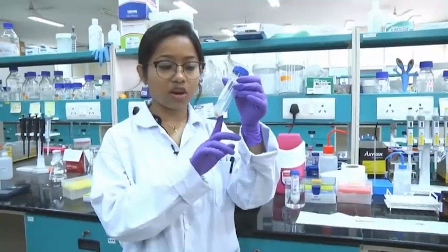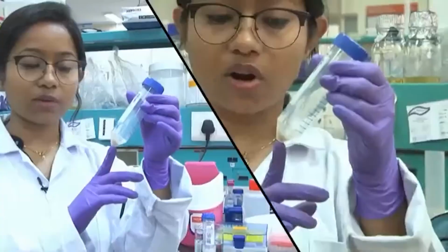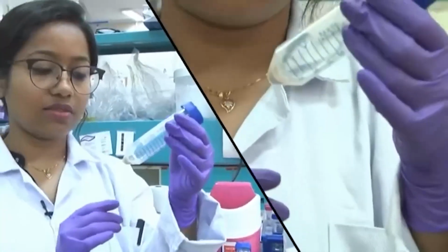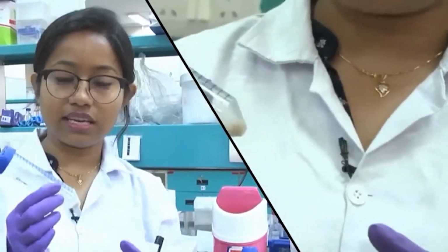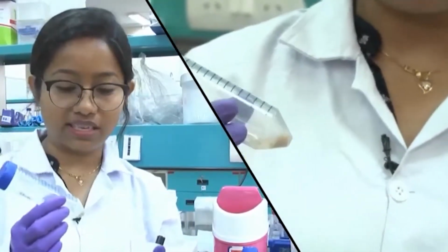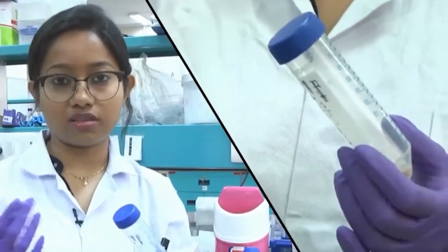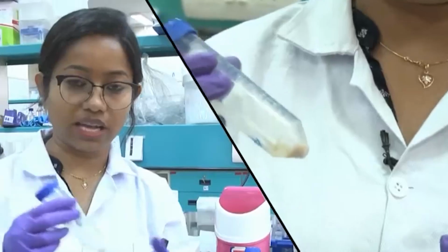So it is a very small amount of culture, around 100 ml. The cell pellet will be at the bottom of the tube, and I have already discarded the media. Here this is the cell pellet. You can keep the cell pellet as it is at minus 20 or minus 80 degrees, whenever you are comfortable. On the next day or some other day when you want to purify the protein, you can purify that particular protein from that.